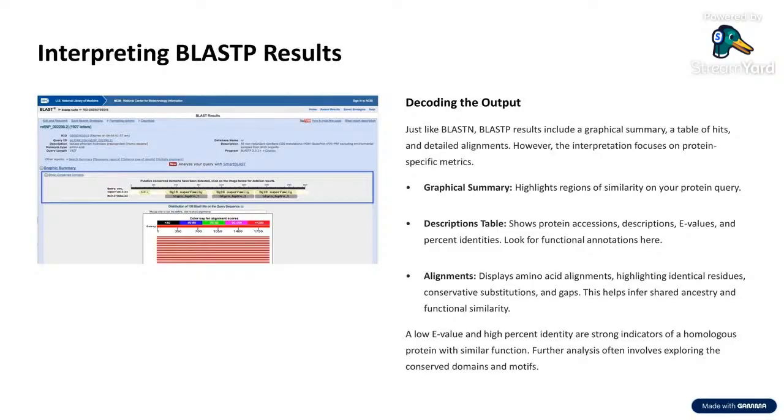First of all, we go to NCBI, choose TBLASTN, input our protein sequence in FASTA format, choose the nucleotide database, like whole genome or transcriptome data, then submit our search. The result will show the regions in the translated nucleotide database that produce a strong protein alignment, with information on which DNA sequences code for similar proteins, and the possible location of an unannotated gene or open reading frames.